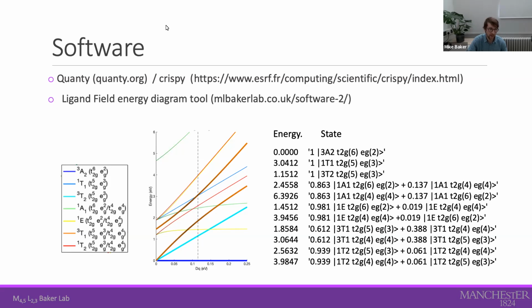I think how you do that and how much you vary things depends on the resolution of your data. If you have really high resolution data, it's not really a problem. If you don't have very high resolution data, you can probably just leave it scaled at 0.8 of Hartree-Fock theory. Okay, cool. Thanks very much.